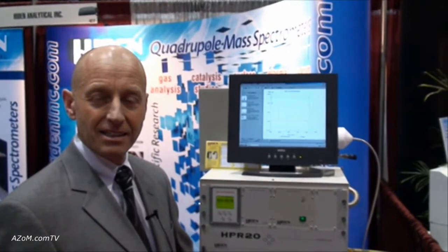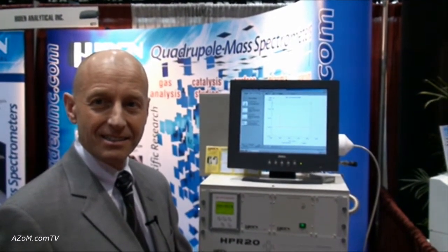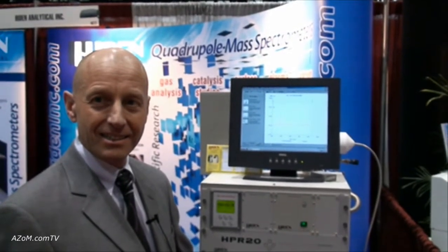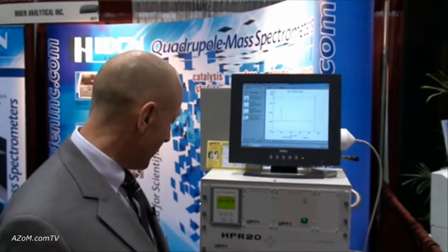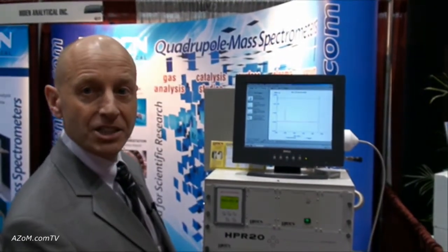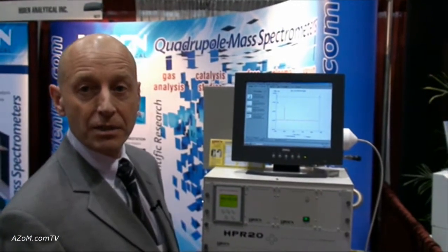This is Cameron Chai from azom.com, and I'm speaking to Mark Buckley from Hiden Analytical. He's going to tell us about their HPR20 quadrupole mass spectrometer. Good afternoon everyone, my name is Mark Buckley. I'm just going to spend a few minutes introducing you to our atmospheric pressure gas sampling quadrupole mass spectrometer system.